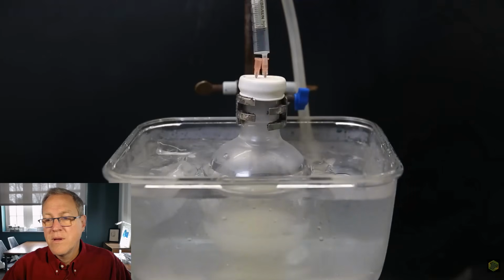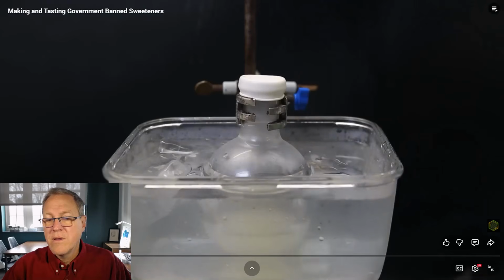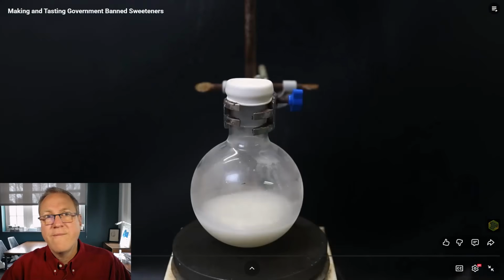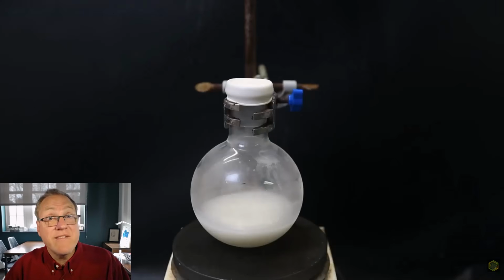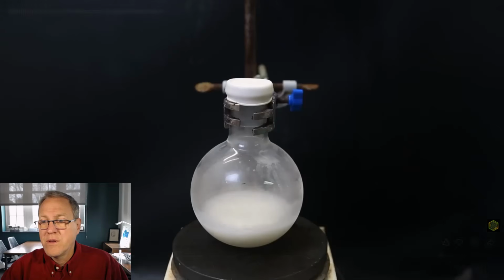But it has all been added. I remove all of the needles and let it stir for a few minutes in the ice bath. Gradually, a white precipitate of the product forms. I then take it out of the ice bath and let it stir. That's nice. It's always nice when you see precipitates like that. That means something's happening. Doesn't mean what's happening is correct, but at least something's happening. You don't want nothing to happen. You want something to happen. At room temperature for 2 hours to complete the reaction.